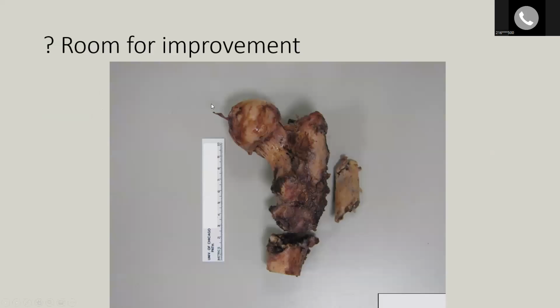All right. So in the last few minutes, I'll just go over my finesse points. Here, room for improvement is quite subtle. I would say if you think about the orientation of a landscape versus portrait, right? Landscape is horizontal orientation. Portrait is like a vertically oriented field.